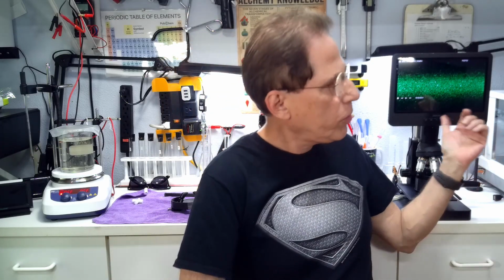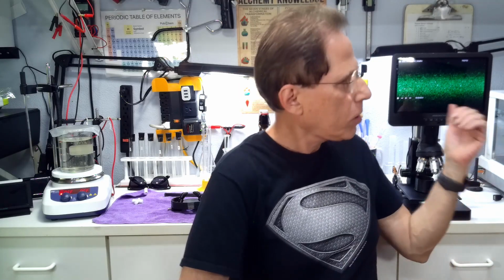As you know, it's getting a little crazy with parts per million and what it looks like on the microscope, and I am trying to come up with a standard for you guys. So when I show you an image, I want to talk about concentration. I'm going to talk about how many milligrams were used in the material, and then I want to talk about the concentration of the colloidal that's on there.